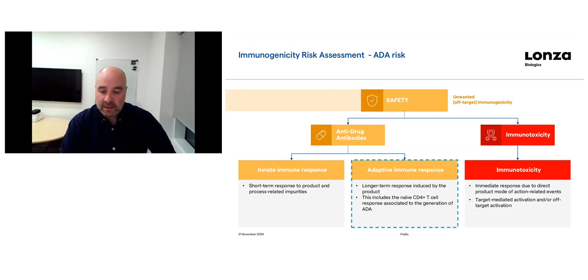So that's only the one immunotoxicity assay, and that's an assay we would recommend for any product, any modality, anything that's being dosed into a patient. That gives you useful information. We do have some people trying to use that assay for dosing prediction. That's a little bit more difficult with cells in a well compared to an IV or a sub-Q dose of a product. But we do see some reasonable correlation with some products, so that's something that we're investigating a little further. I did also touch on the innate immune response. I'm not going to go into that in detail right now.